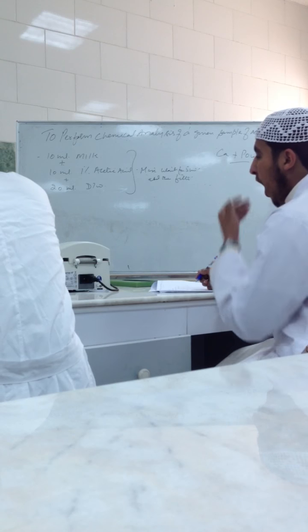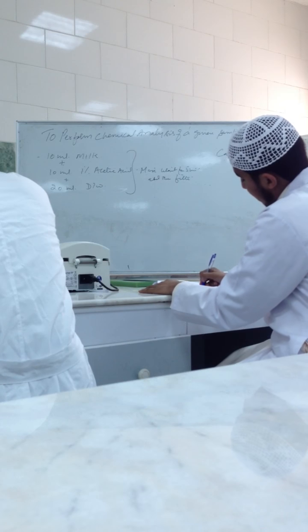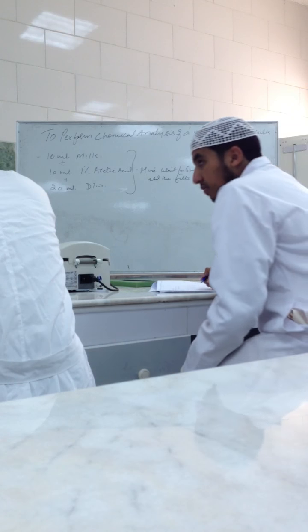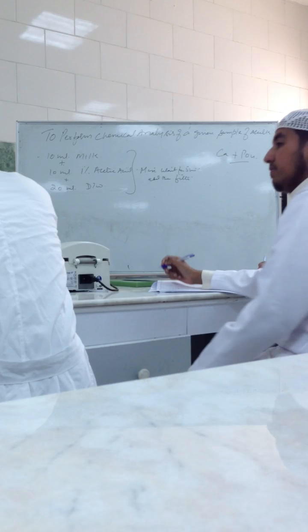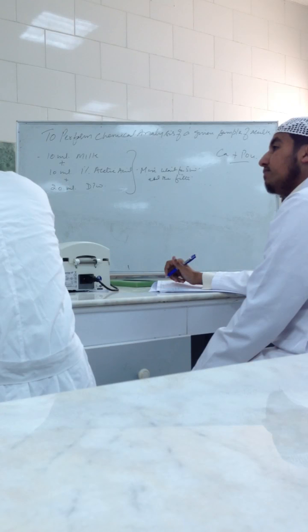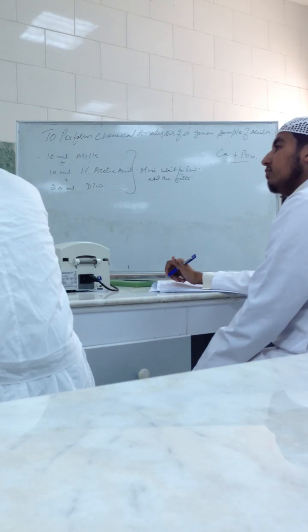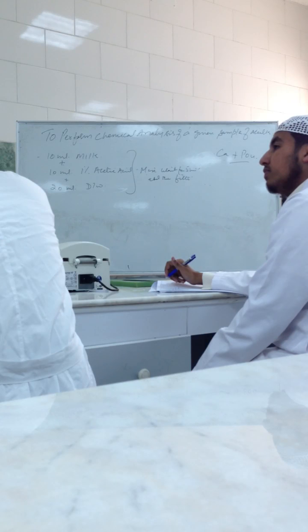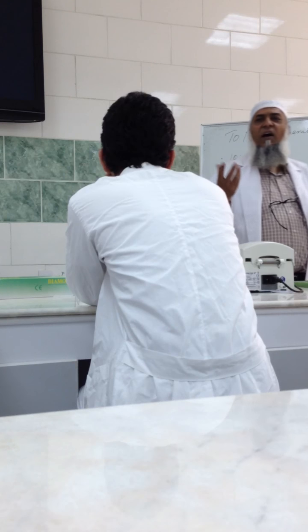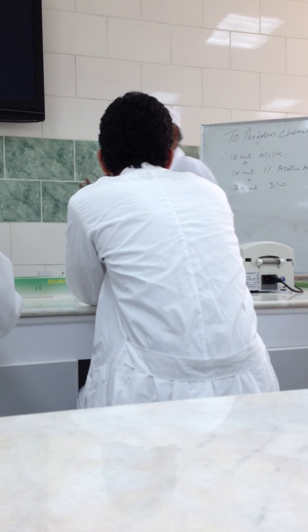And then take a funnel and a beaker and put this filter paper inside here, and then add your solution here. Add the solution here and then wait. Through the filter paper, the solution will pass dropwise, gradually it will filter out, and within 10-15 minutes you will get a filtrate of the solution.